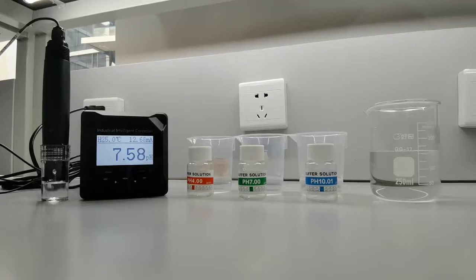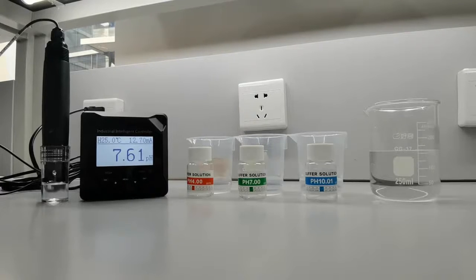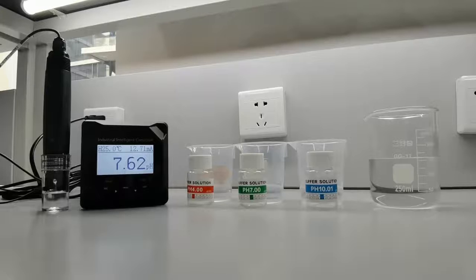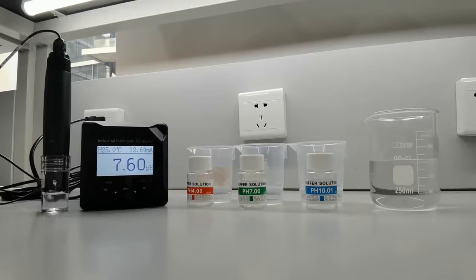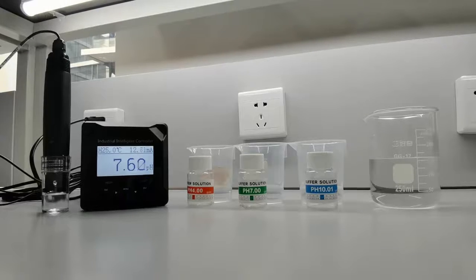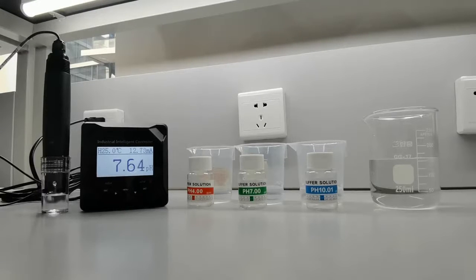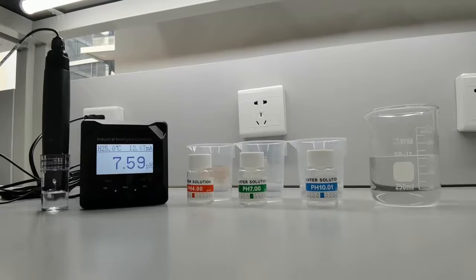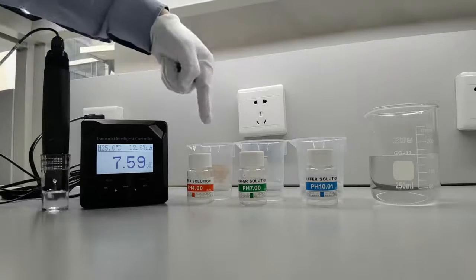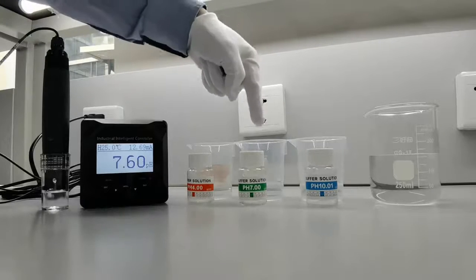In this video, we will learn how to calibrate Supmea's pH meter with plastic sensor. The parts of the pH meter include the controller and plastic sensor. The pH meter should be calibrated using colored buffer standard solutions of pH 4, pH 7, and pH 10.